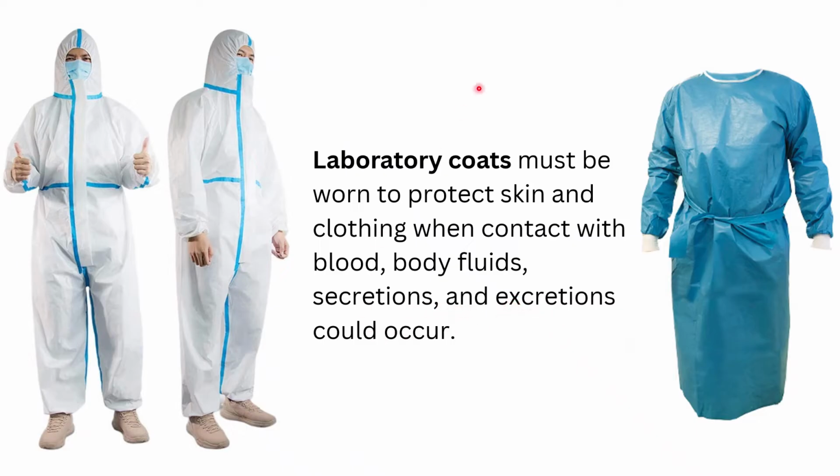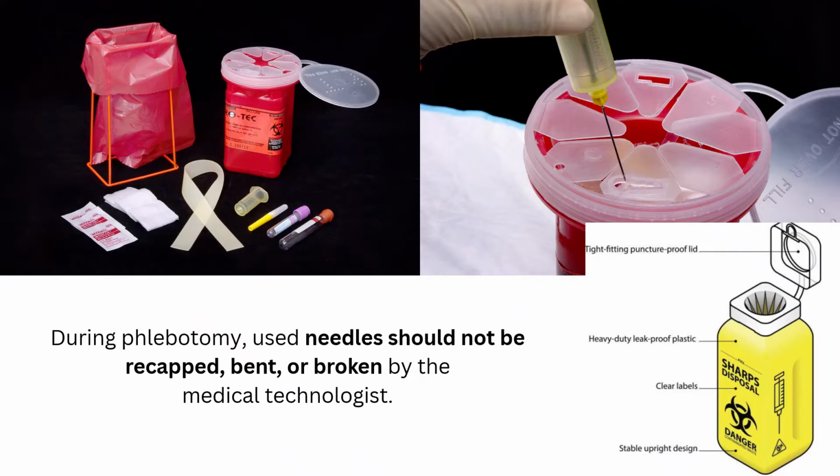secretions or excretions. During phlebotomy class, we're always advised that used needles should not be recapped, bent, or broken by the medical technologist on duty or the phlebotomist. That is to prevent needle stick injury from happening. And in the laboratory, we're always provided with tight-fitting, puncture-proof, heavy-duty, leak-proof sharps disposal containers.